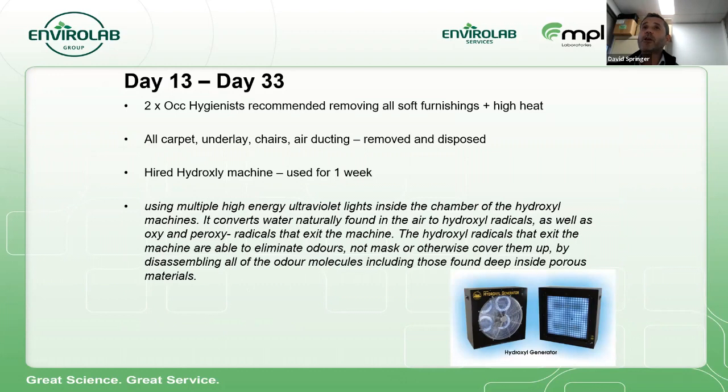We employed 2 occupational hygienists to give us some advice. Because our results weren't going down quick enough, they recommended actually removing all the soft furnishings. So all the chairs, the air conditioning ducts, all the pin boards, curtains, everything was ripped out of the lab and disposed of. And then one of them suggested this hydroxyl machine, which I wasn't aware of what it does. You can have a quick read there of what it does. We're assuming that hydroxyl machine in conjunction with all the cleaning we did is probably what worked. So we'll move on.